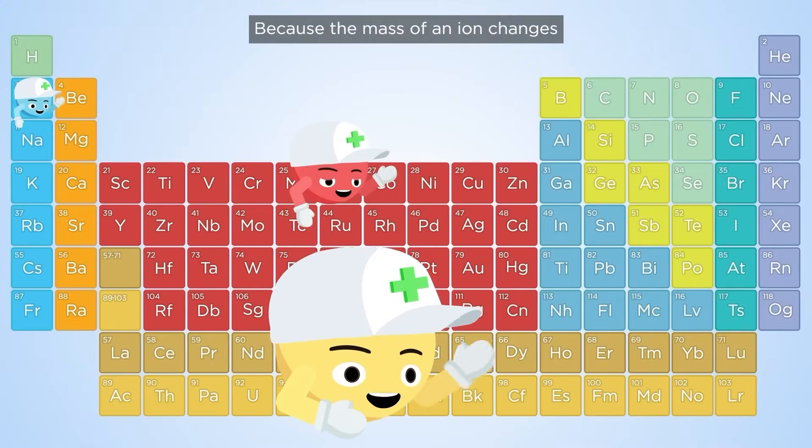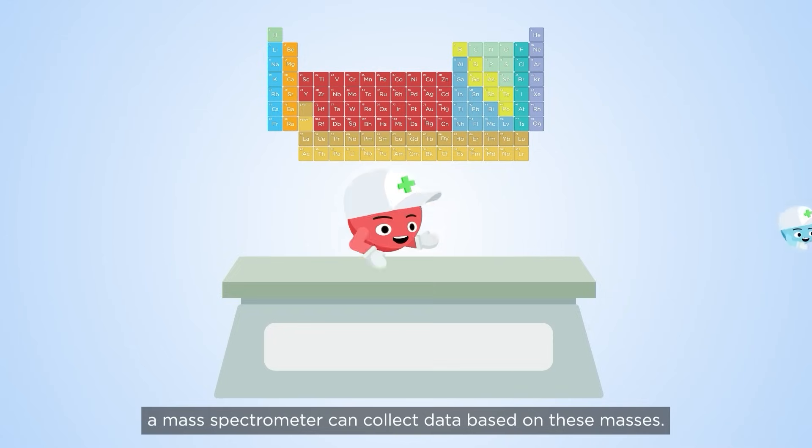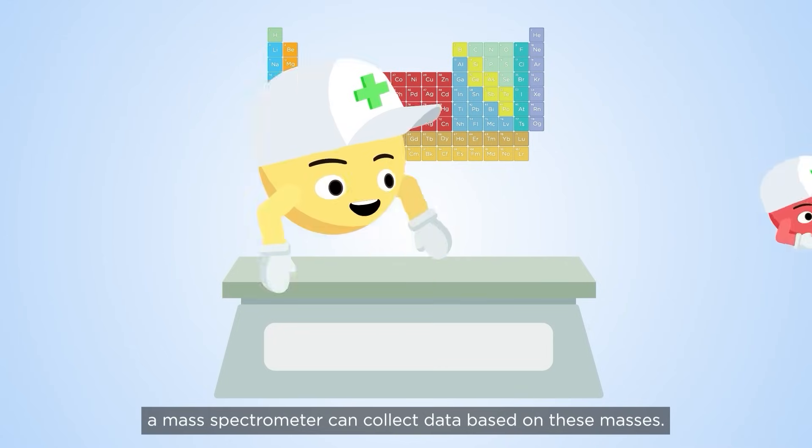Because the mass of an ion changes depending on its number of protons and neutrons, a mass spectrometer can collect data based on these masses.